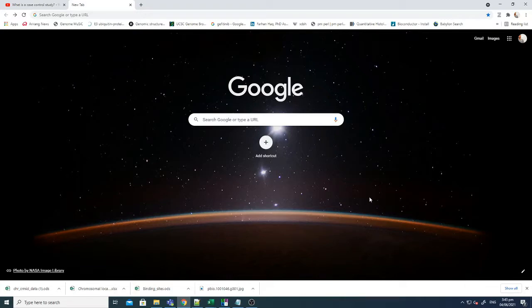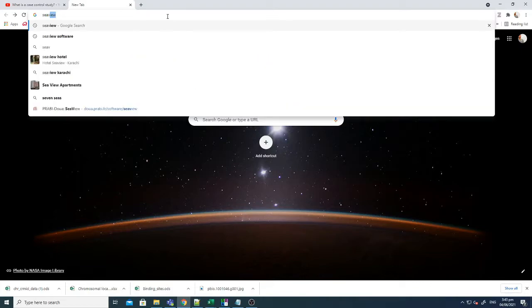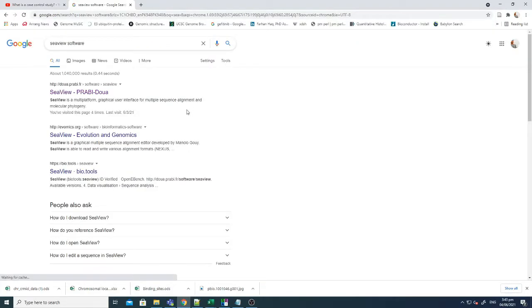It does not need a lot of prerequisites to install or any packages. You just need to go on the website and download it and use it. So the name of that software is SeaView software.